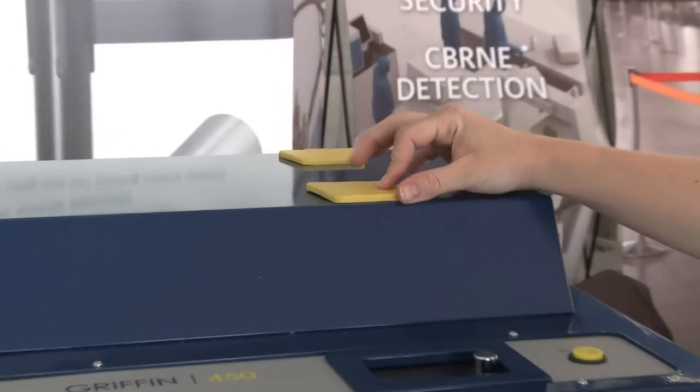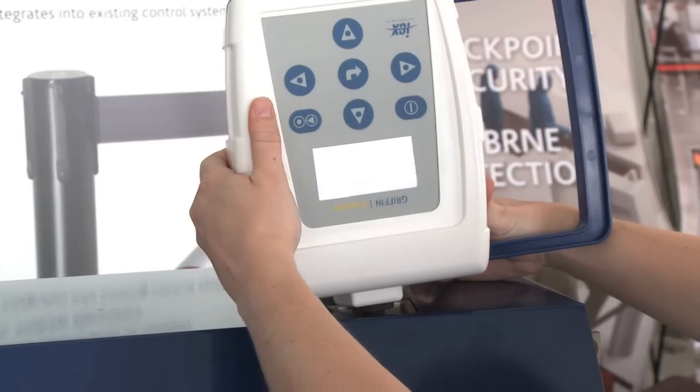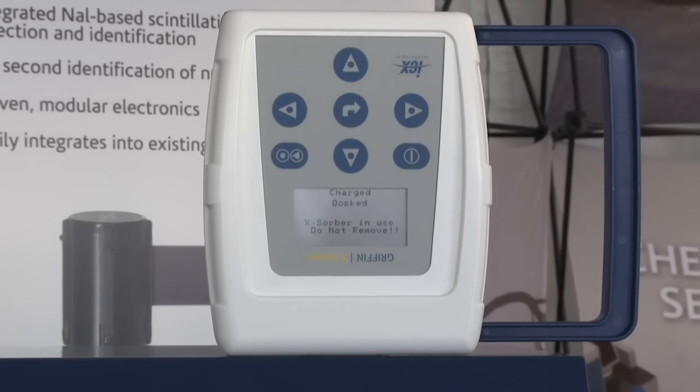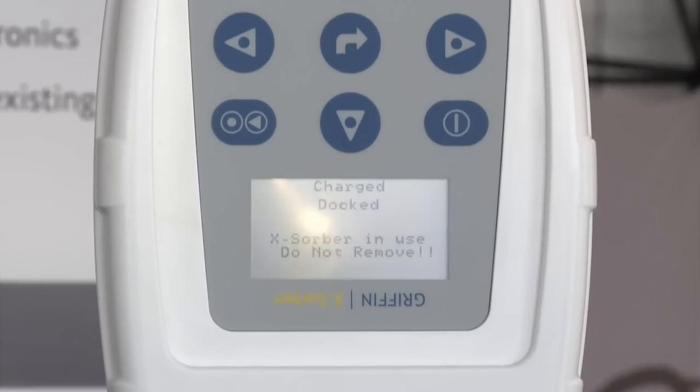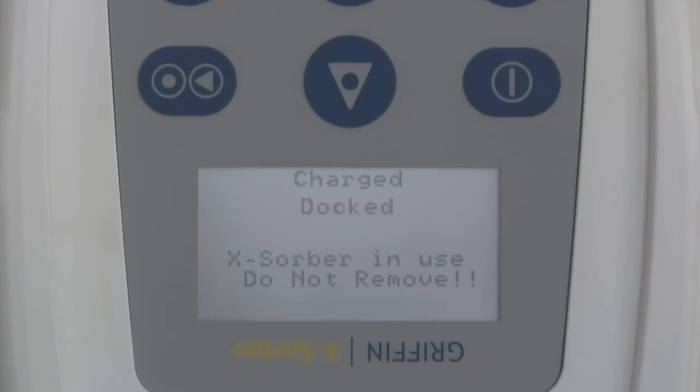You can see there's a triangle here, so you line up the shape with the display facing you. If you zoom in here, you can see it says 'charging docked.' On this port, while you're working with the instrument, it recharges the battery.